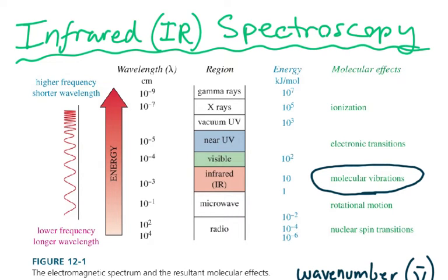So here on the left, we have a spectrum of light or other electromagnetic radiation and what it can do. And it turns out if you have infrared light, infra means below, so infrared is below red in frequency, not in wavelength. Then we can make molecules vibrate. Electrons don't get excited, but the molecules vibrate. And this vibration is going to be based on how strong of a dipole moment that you have.